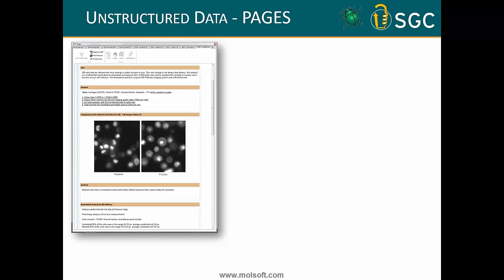So first thing I'm going to do is to show you a few screenshots of what Scarab looks like, and then I'm going to try and flip into Scarab and show you some live examples of building some of the pages, as they're called, and also some of the structured queries and data adding, and hopefully everything works fine, but we'll see how it goes.